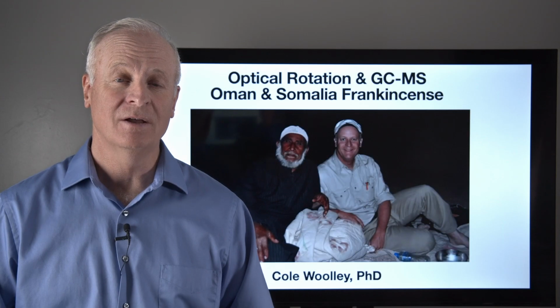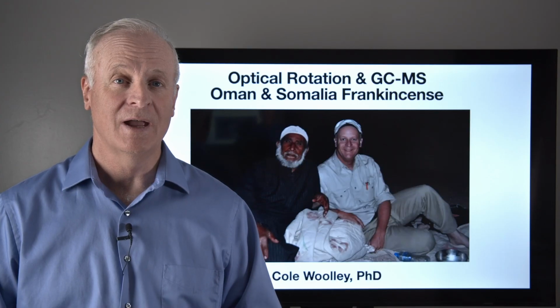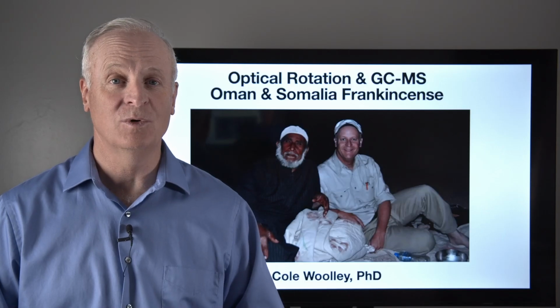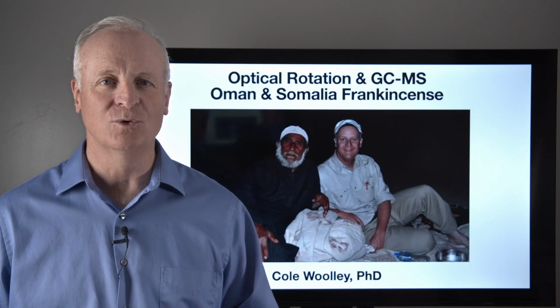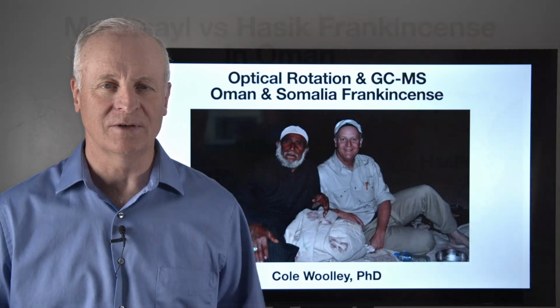I'm going to take the optical rotation for Oman frankincense and compare it with the optical rotation of Somalia frankincense in combination with GCMS data. Oh, this is going to be exciting. I'm using two analytical tools together to see if there's a difference in these two frankincense.